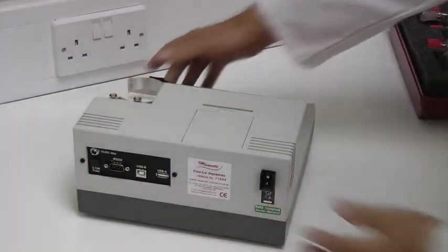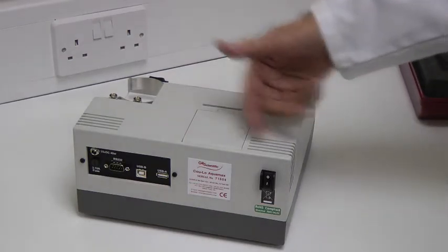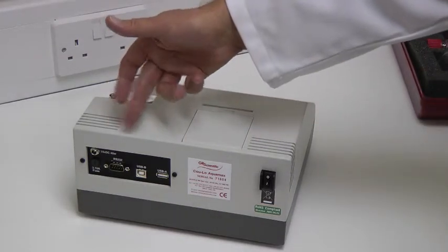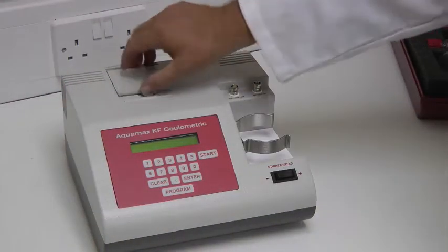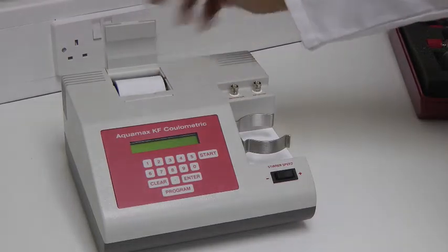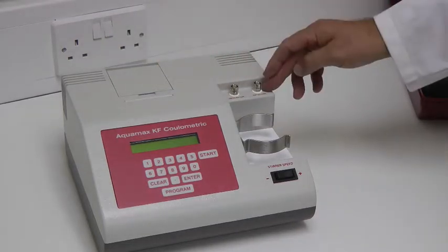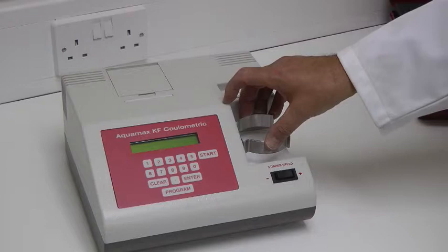At the rear of the unit are the power switch, the power inlet, the fuses and the RS232 and USB connections. At the top and front are the printer, connections for the electrodes, the titration vessel holder and the front panel.